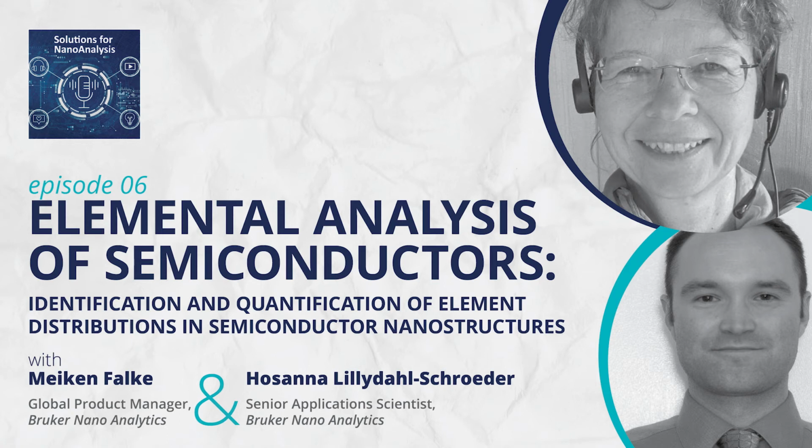Fair enough. So going back to your discussing trying to use dark field contrast images to determine differences between elements, basically using those instead of, say, EDS or EELS or some other elemental analytical technique. Arthur, on that note, if you're dealing with multiple heavy or multiple light elements, moving towards the light elements, like nitrides used in semiconductors, also carbon, boron doping.